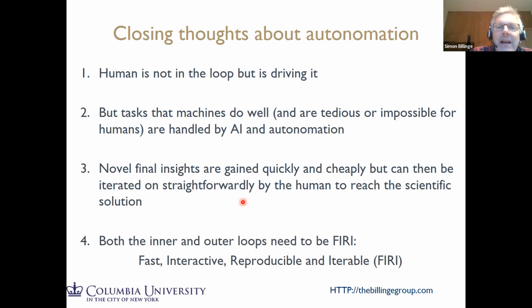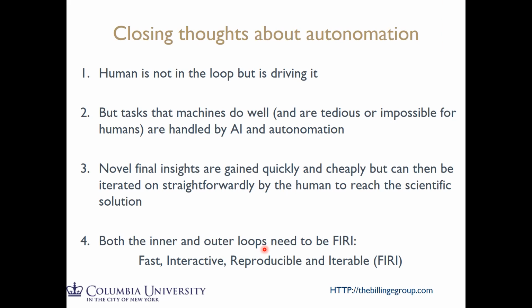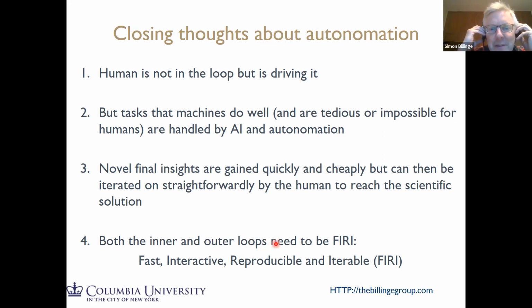And I want to make one last little plea, coming back to the data. There's this concept in data science of a FAIR database, which is findable, accessible, interoperable, and what's the R? I forgot. But reusable. Reusable, yeah. And this is a very powerful concept because we all save data, but it's very rarely FAIR.